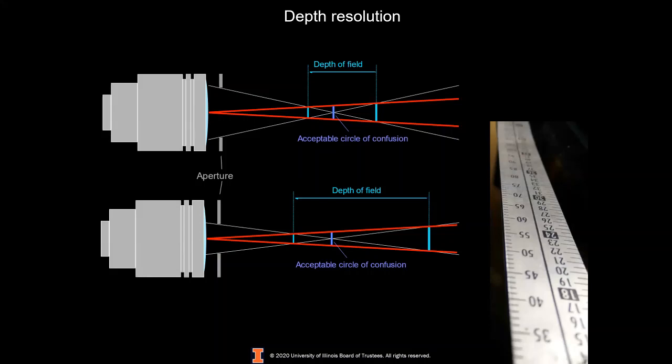For example, in this case with the ruler here, we have the image being more or less focused, or with a good focus, between the 20 units and 30 units on the ruler. So if I have a focused object using the same lens and the same camera, I know that this object will be between 20 and 30 units away from the objective lens.